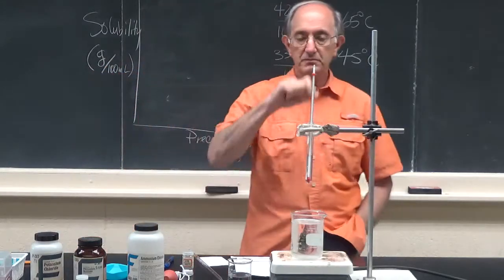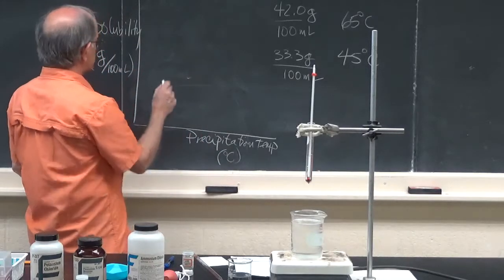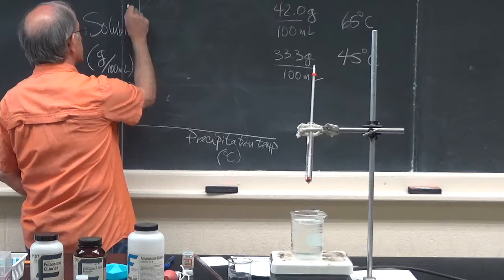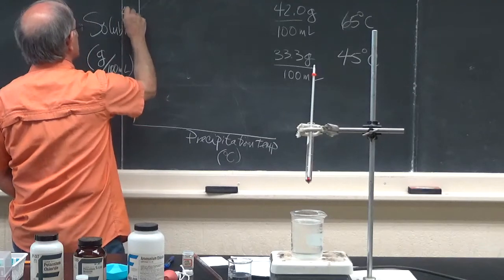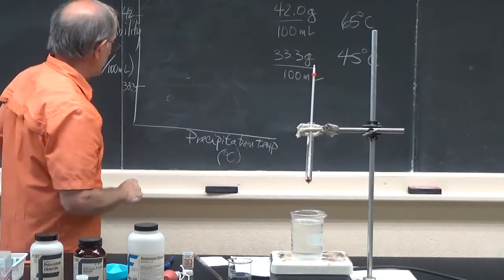Okay? So, what you will see is that, let's plot 33.3 and 42 grams per 100 milliliters, okay?